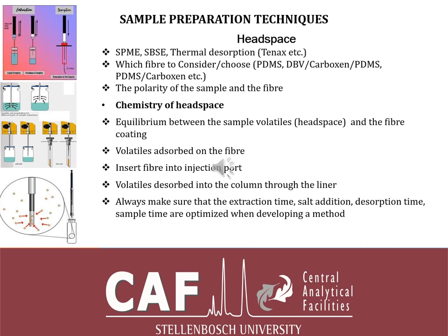It's always mentioned that the extraction time, the salt addition and the desorption time are optimized when developing a method. The extraction time needs to be optimized, because you might find that for some compounds 10 minutes extraction is enough, for some 20 or 30. The same goes for salt addition: 10% salt, 20% or 30%, because when you add salt, it helps the compounds of interest to move more into the headspace, where they are more comfortable than in the sample. The salt addition also helps to protect the fiber from swelling.